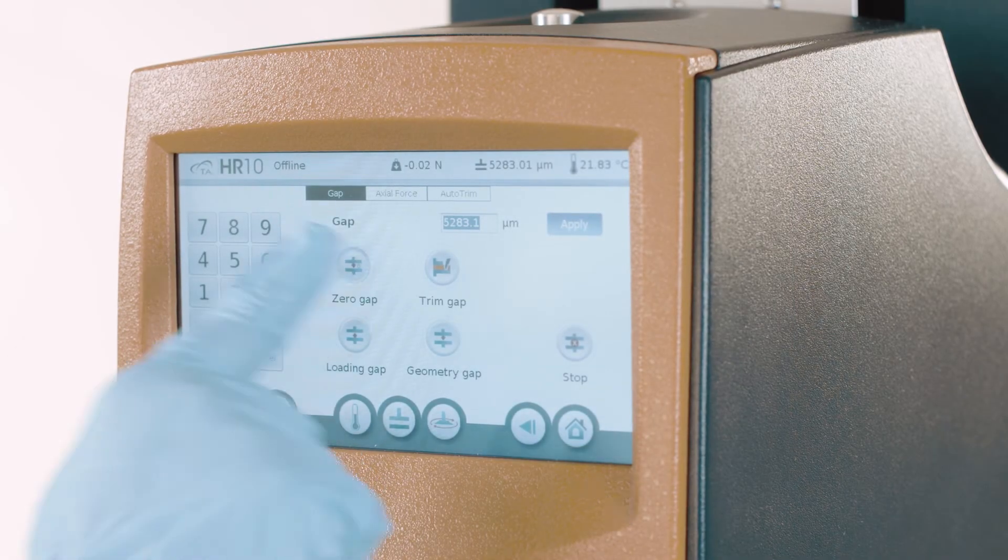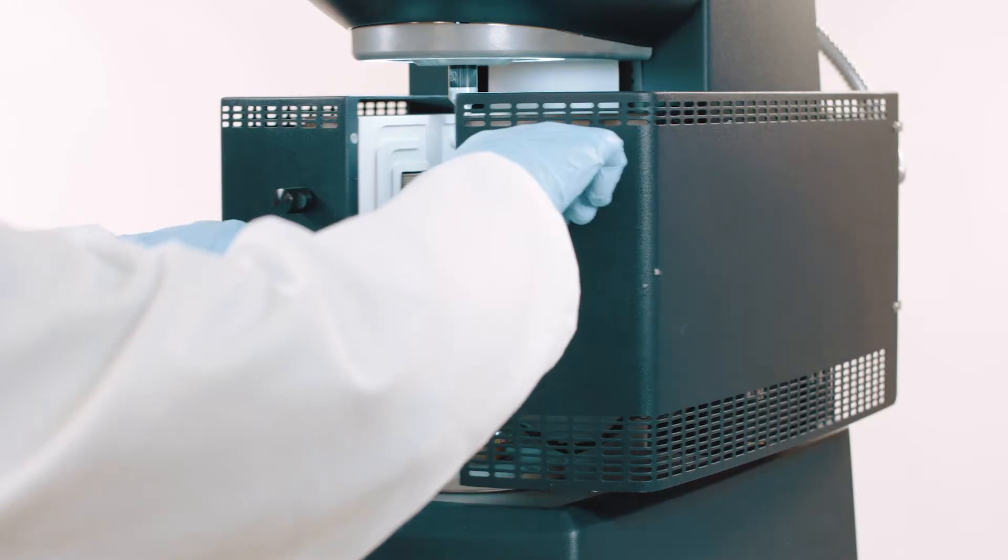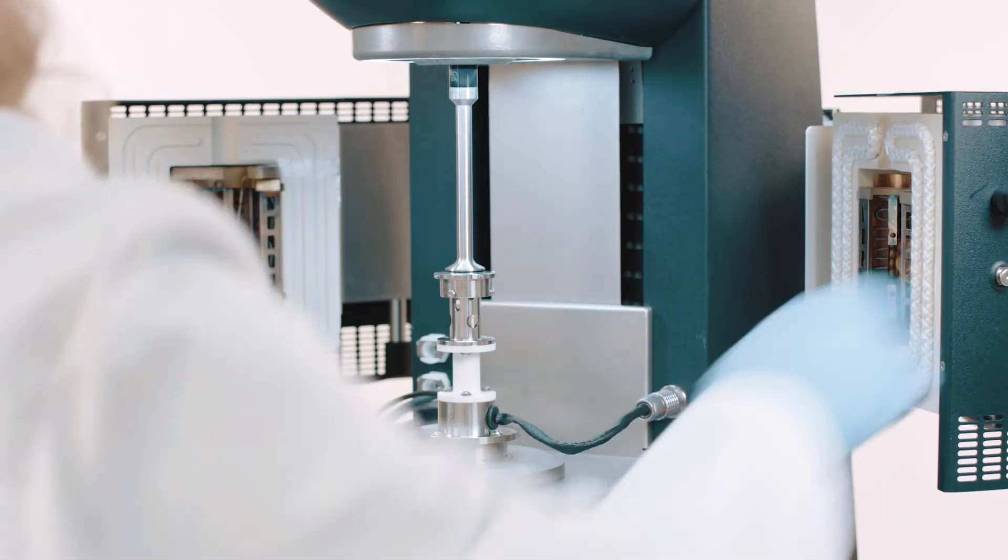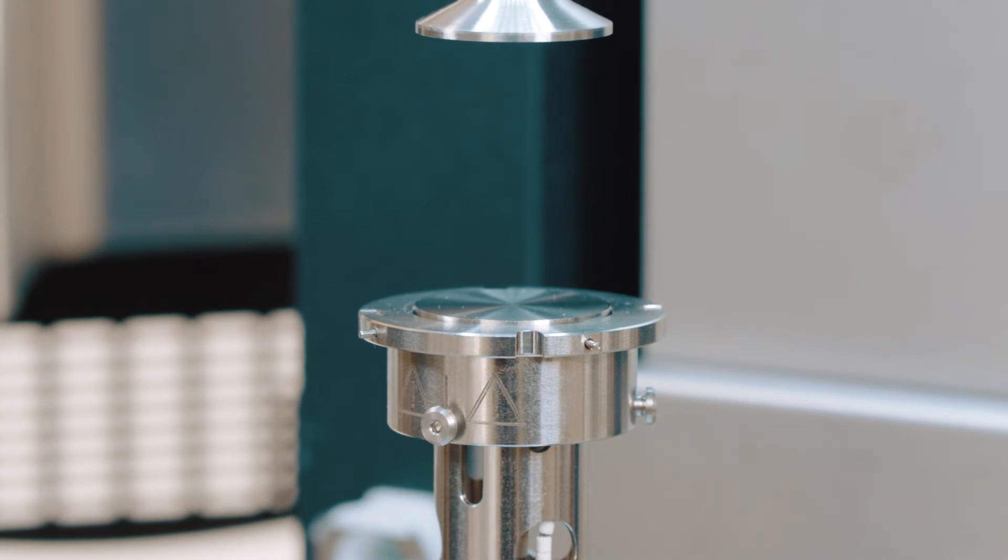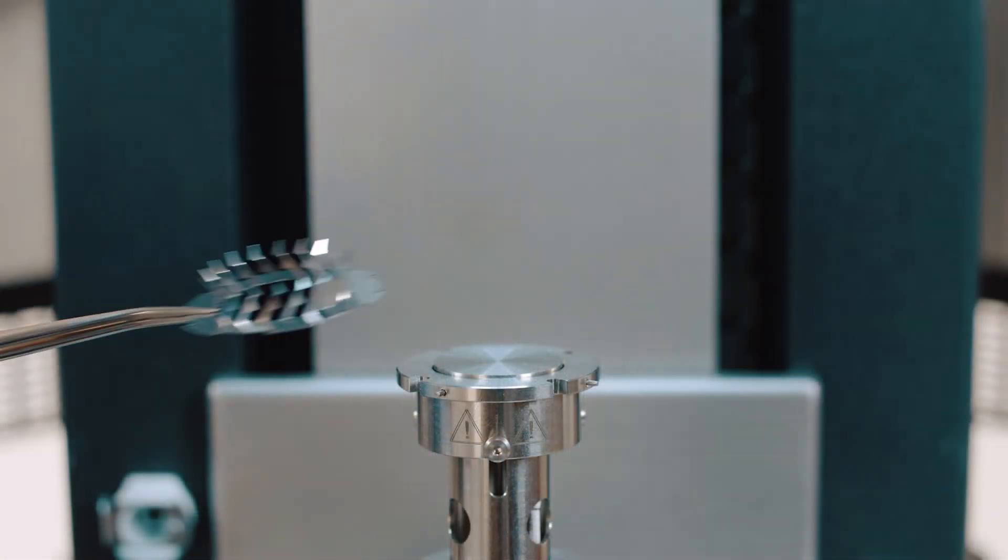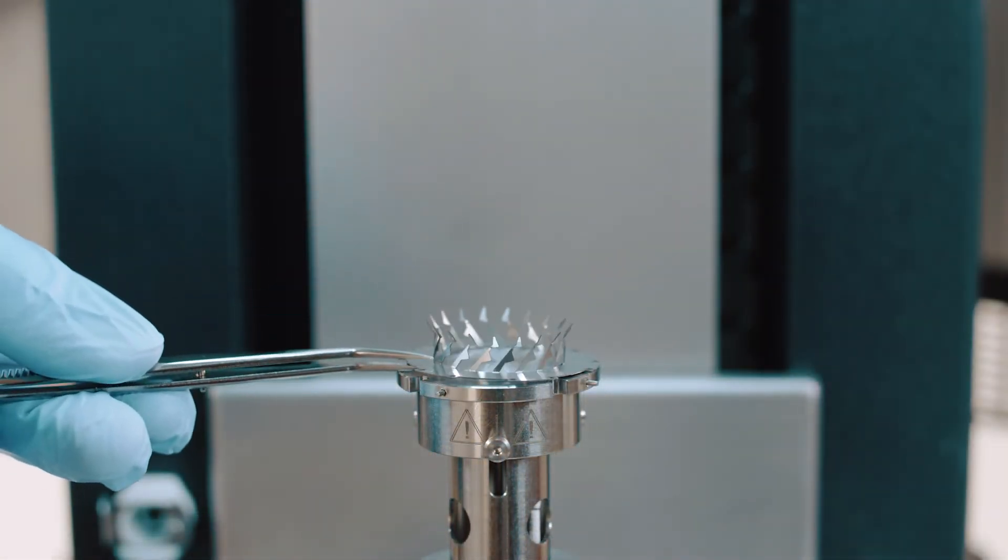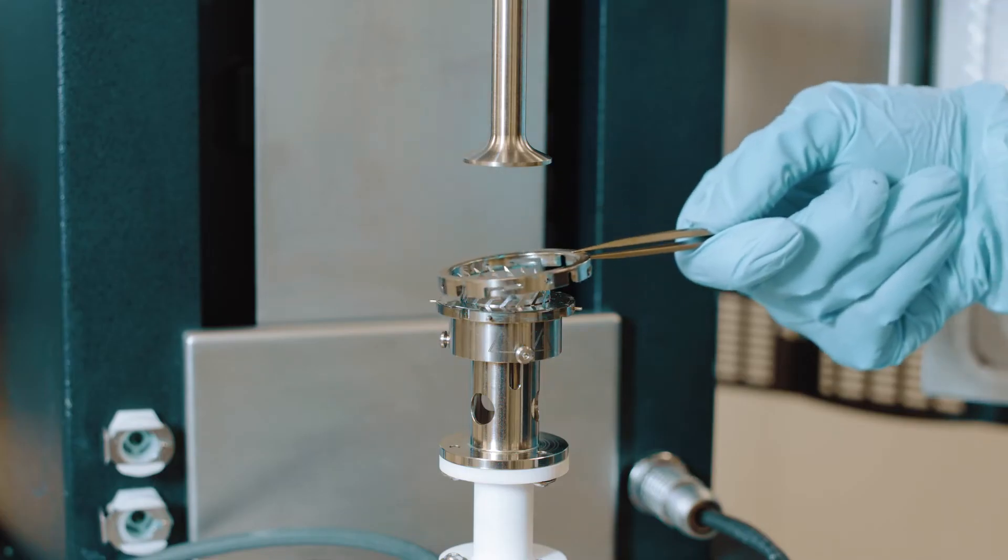Zero the geometry gap and open the oven doors. Raise the geometry to the loading gap. Using tweezers, load the disposable trimmer and secure it with the locking ring.